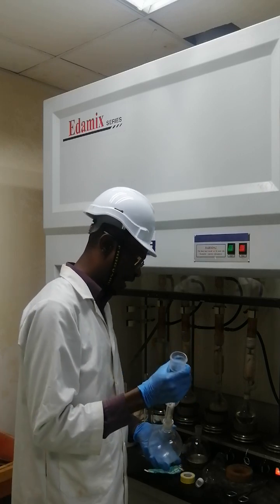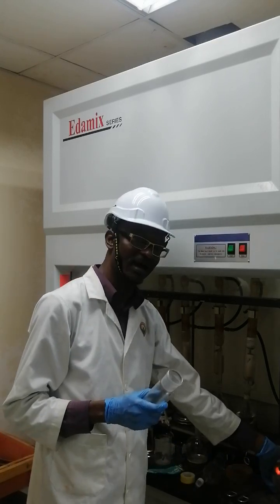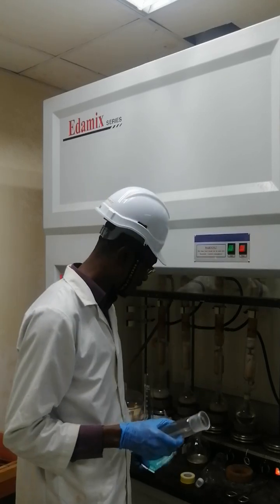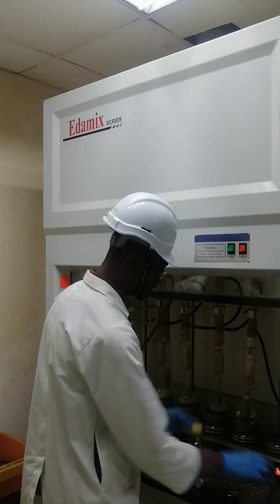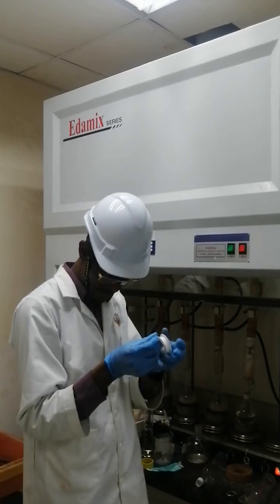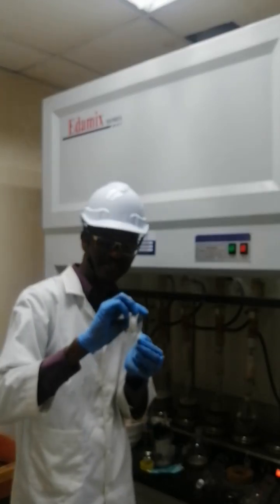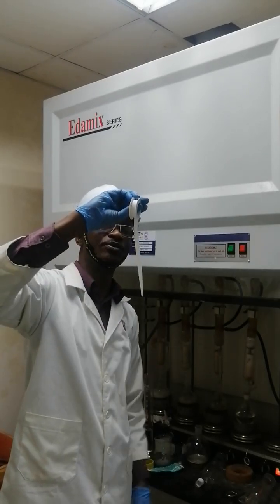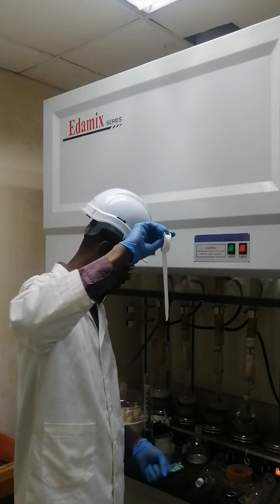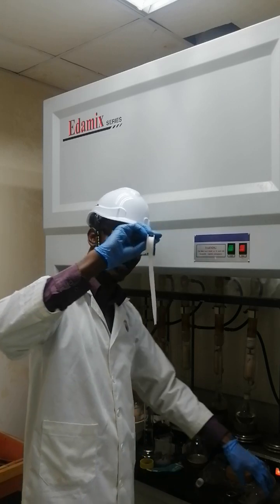Another way, if you don't have access to the high vacuum grease, is to use PTFE tape. I'm sure you have seen this being used by plumbers to provide sealing for joints, when they are laying pipes, the joint between pipes. So you can also use this as an alternative.